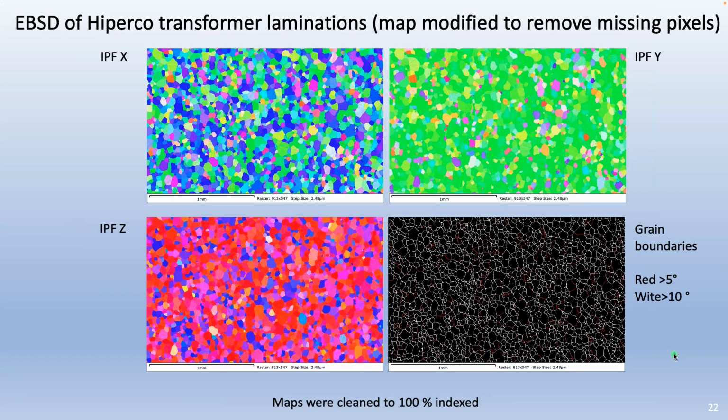Yeah, I think many of the same issues are going to come up, except you have to be very careful now in your software and your setup to understand what the software is calling the X, Y, and Z directions for your sample, knowing that the Z is always now a cross section through your sample rather than a surface Z, if you will. I think that's one of the main things, is understanding that.